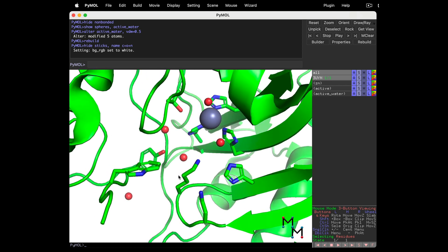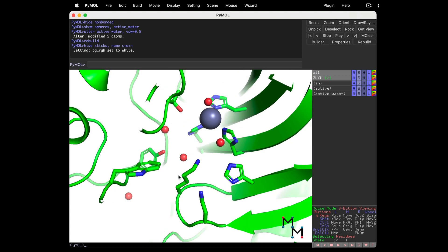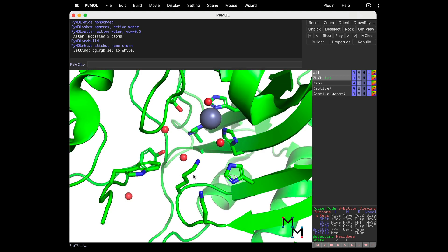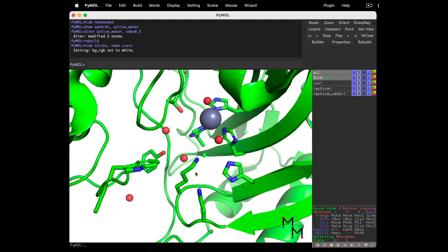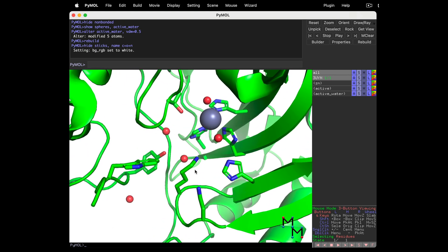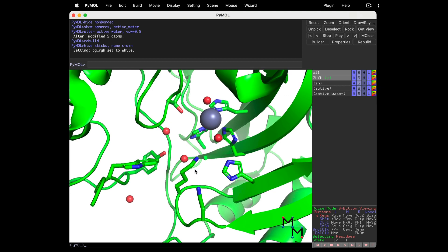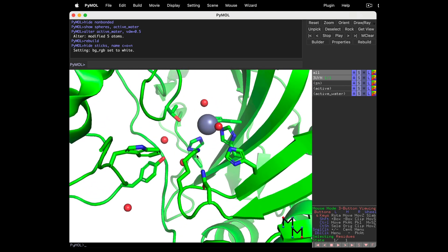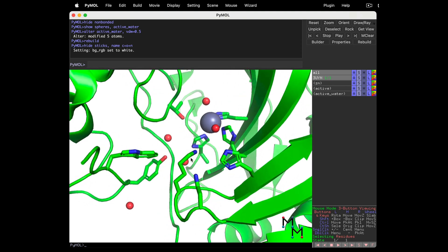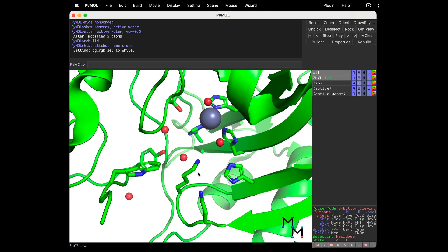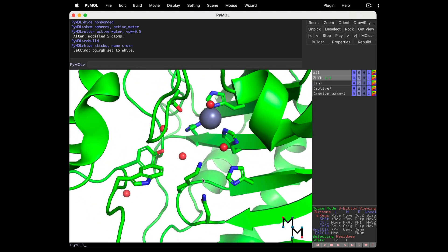The clipping we learned about in Lesson 1 can be helpful. Scroll two fingers up and down on the trackpad to adjust, or use the scroll wheel on a mouse. Now cut off cartoon renderings look pretty bad too, so this part takes time to get just right.